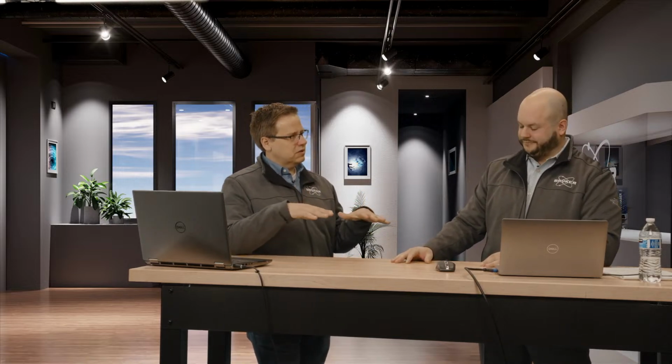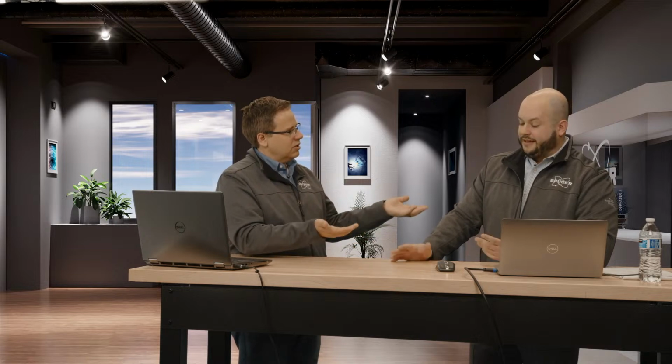Yeah. So now, when we talk about texture, like we said, it's not about how something feels. It's not that rough feeling or even a texture that you would apply in computer graphics. This is different, right? That's right. So we're talking about the crystallite orientation distribution in a material. Yeah. So I always think about it that most materials out there are like sand on a beach. It's made up of all these tiny little crystals, and they're kind of smushed together. That's right. And each crystal has a direction it's pointing, and that matters. It turns out in industry that matters.